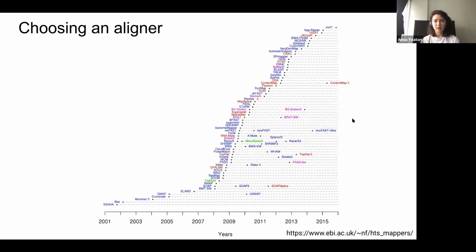Like the references shouldn't be different. Oh, Sana says that there's a module that helps you get those standard references on Big Purple. I didn't know that. But what's great about UCSC is the GTF files that have different reference annotations for different databases like RefGene versus Ensemble.